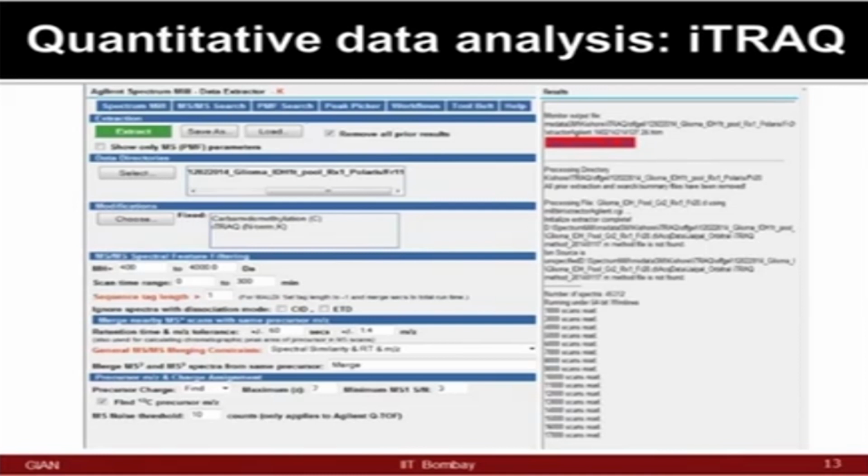One platform which you will see today is based on the commercial setup we have available here, but you can still use Mascot if you do not have the specialized software available. You can still use Mascot for doing data analysis. The only thing is, if you have access to the complete Mascot database, your search will probably be much more refined.